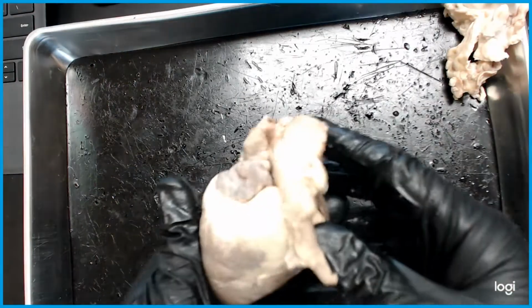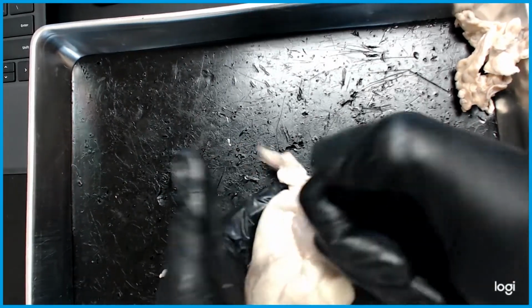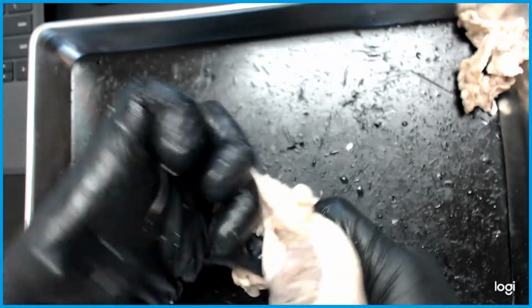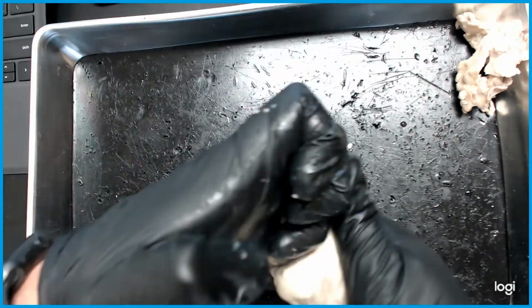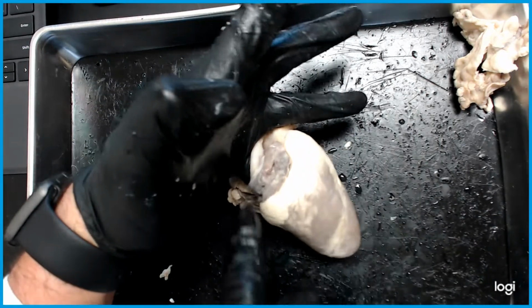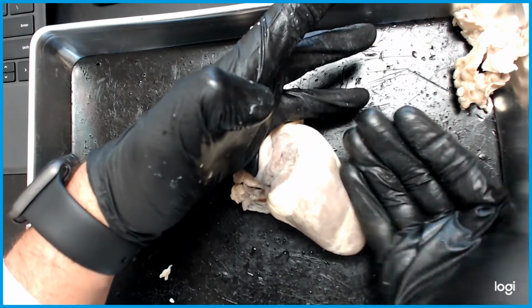If you compare it to the opposite side of the heart, the left side, and we look for an opening that reaches the left atrium, you can tell that the cavity is much, much bigger. So this chamber down here, the left ventricle, is much bigger. So we find it. There's the atrium. Now I want to open up. Keep in mind, remember this is where the septum is going to run through. I want to make an incision here so I can open the flap this way. And that's what I'm going to do.